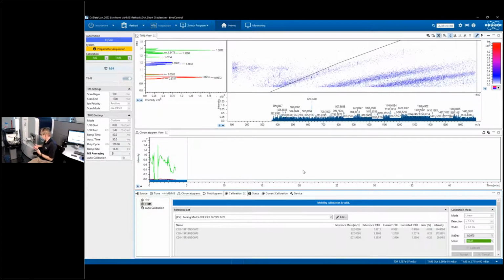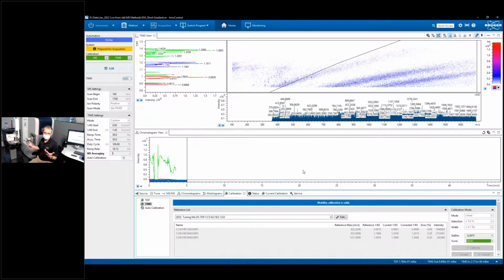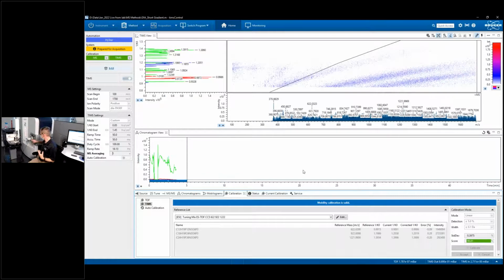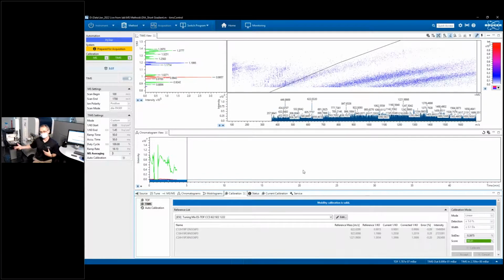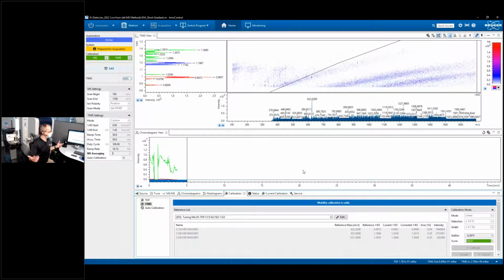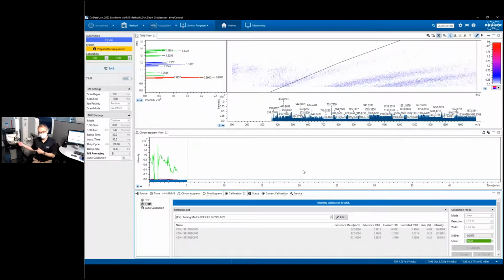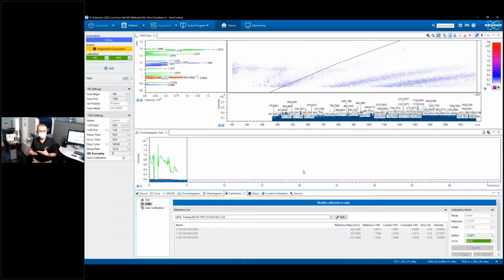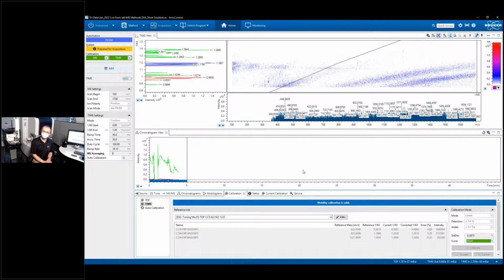After that, probably every 6 months or so, maybe sometimes a year, depending on your throughput, then that glass capillary, which is the interface between atmosphere and vacuum, we'll need to take out and clean. Typically, the system comes with 2, so you can remove one, put the clean one in, and you can have them back up and running in like 2 or 3 hours. So it's really quite quick.